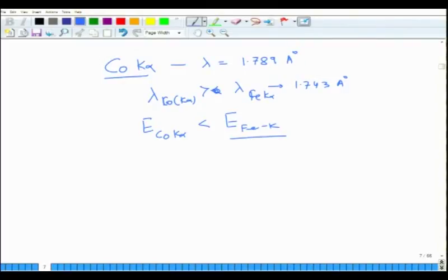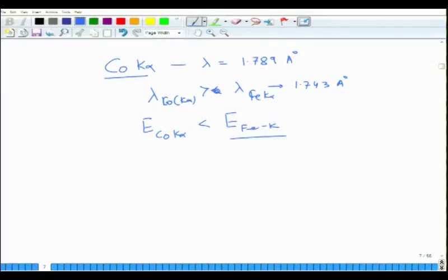So, you can use this knowledge of the absorption edge with respect to the incident radiation in different ways. You can choose an appropriate filter to filter out K beta, but at the same time you can choose an appropriate radiation which will not lead to background radiation in the form of secondary X-rays out of the material you are using for analysis. So, basically these are two uses of knowledge of the absorption edge. For nickel, as I said, for copper CuK alpha we use nickel filters, and there are other materials for which we use different filters.